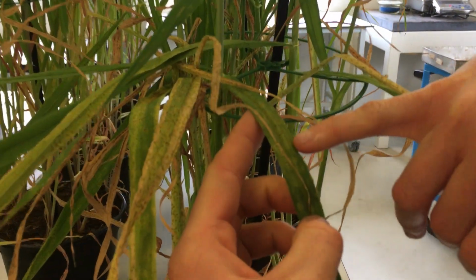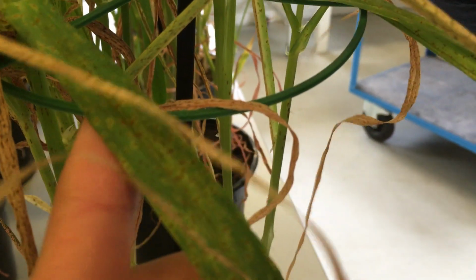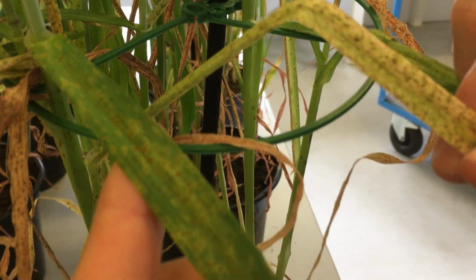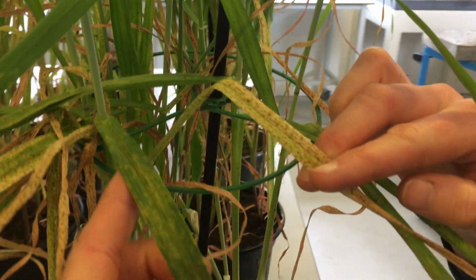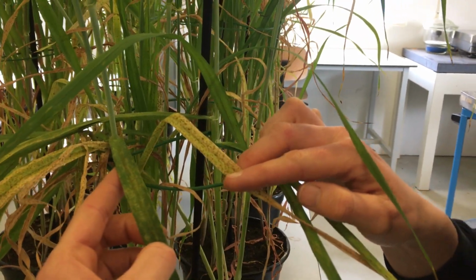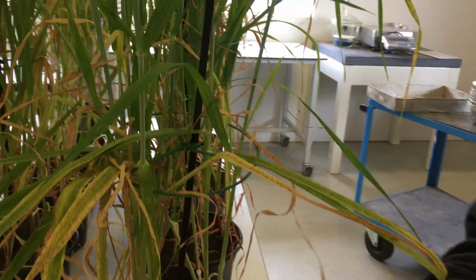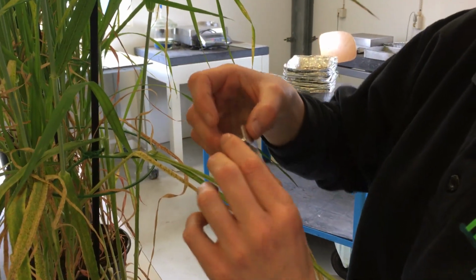How should I look at it? I'm zooming in. It's a brownish color and it's in 3D. It seems it comes out of the leaf, whereas the necrotic spots are in the leaf. Okay, if I want to look closer, what do I use to see the pustule on it? Yeah, then it's best to look with a magnifying glass. I'm taking one for you. Oh, thank you.